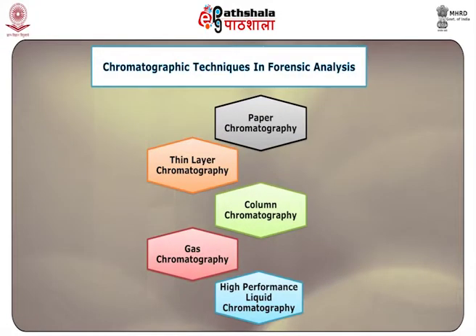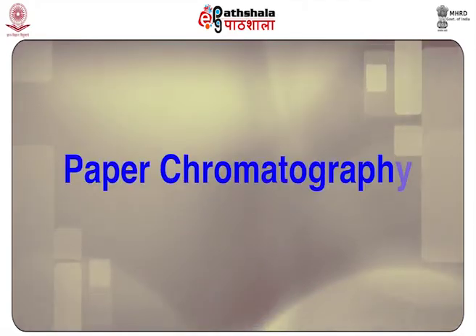The common chromatographic techniques that are employed in forensic analysis are paper chromatography, thin layer chromatography, column chromatography, gas chromatography, and lastly, high performance liquid chromatography. Moving on to paper chromatography.